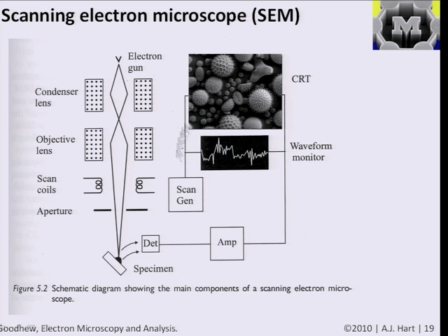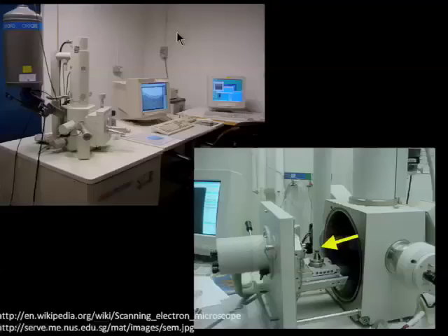And then through a bunch of electronics, which in addition to innovations in the emission and the optics have let the resolution increase over time, you get an image, and you can control the scan speed versus the quality and so on. You end up, say, looking at the surface here, and I don't know what this is exactly, but it looks like, for example, some pollen spores or some diatom-like structures.